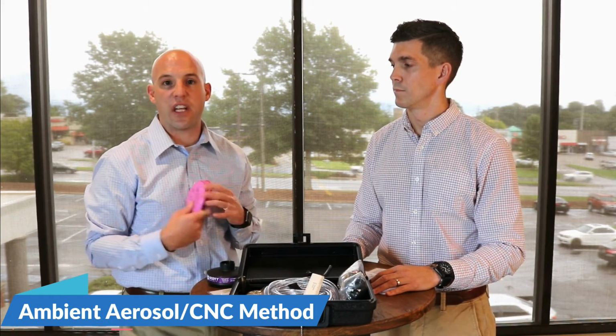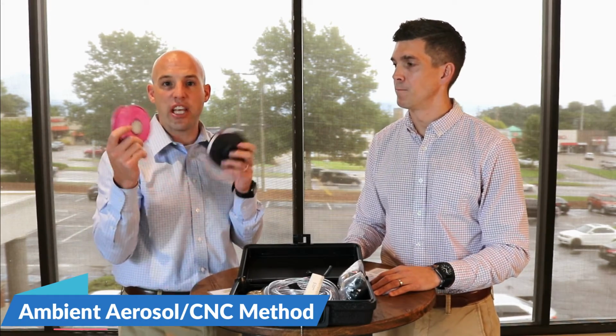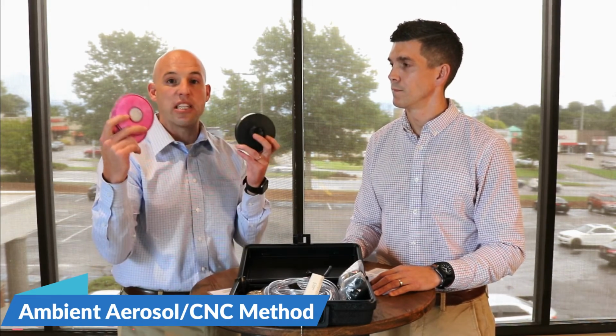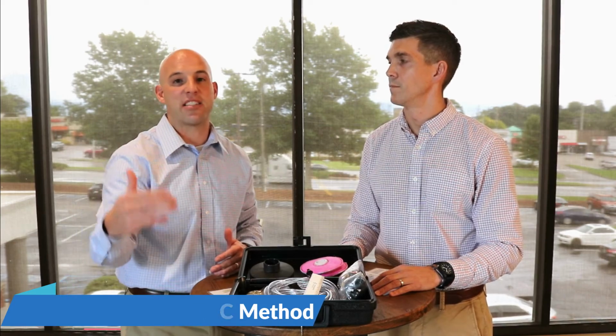If I was doing a fit test and I coughed or breathed on these filters and there's no way to decontaminate or clean these filters, if Luke was to do a test next, does he really want to breathe through the same filters? So in some cases, even the filters can be a consumable, and you'll need to replace those in between fit tests, and that's on a case-by-case scenario based off of that organization's comfort level.